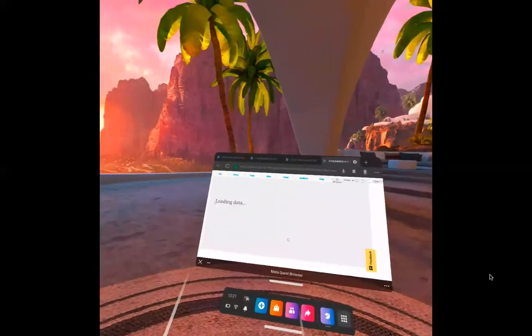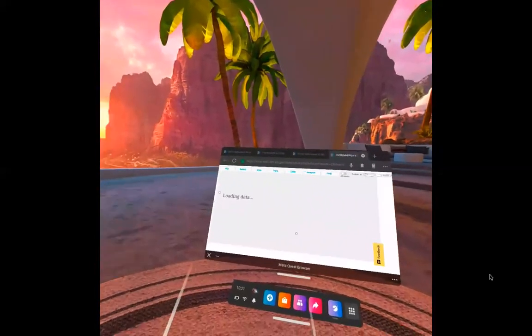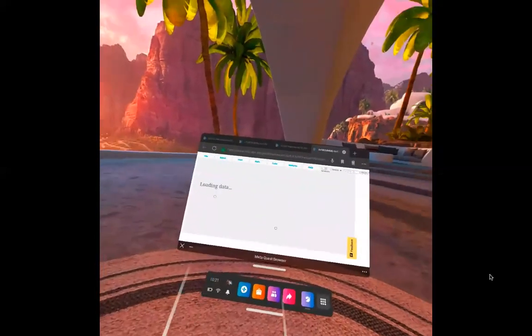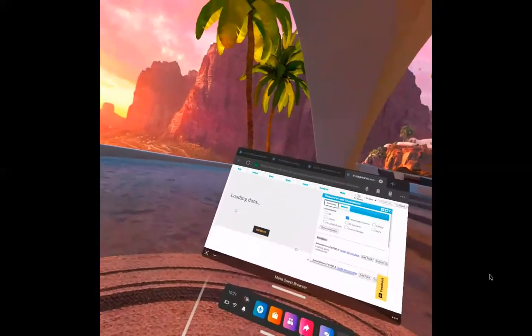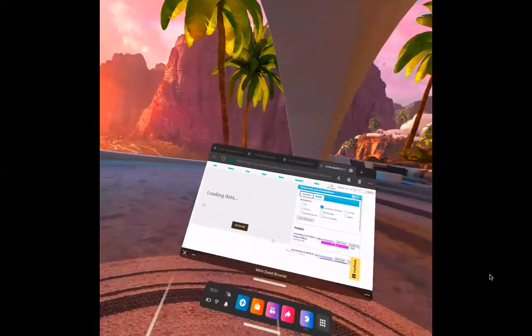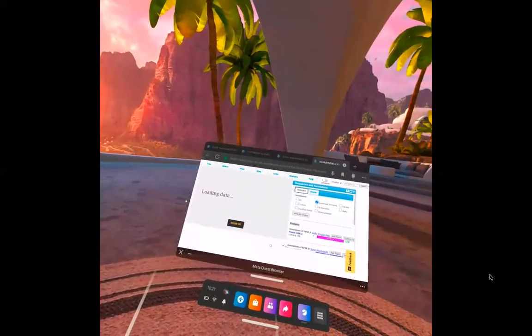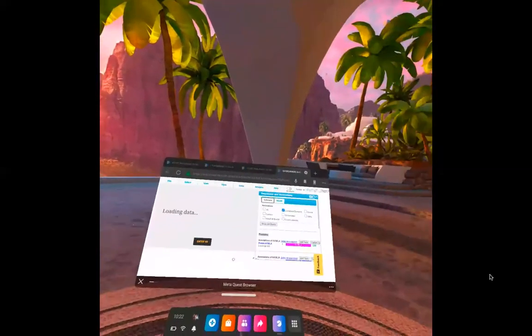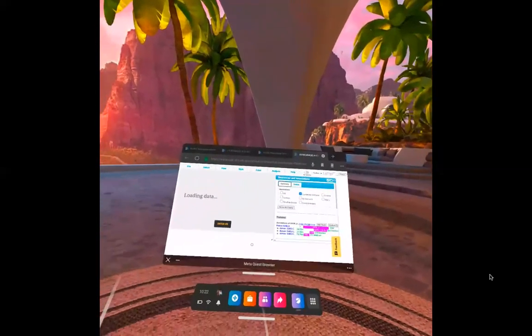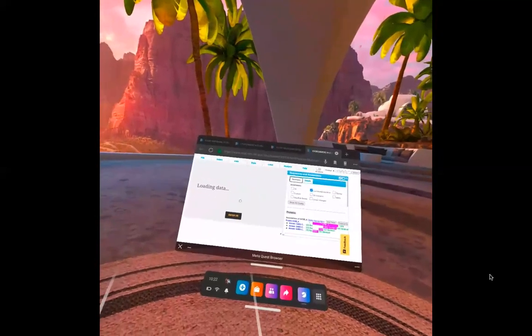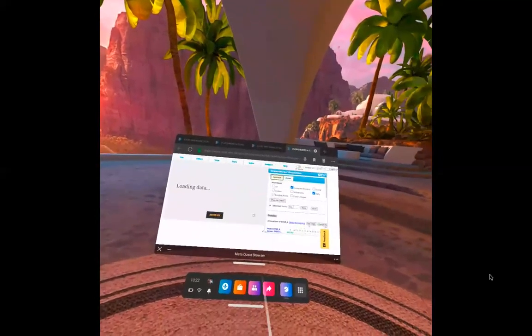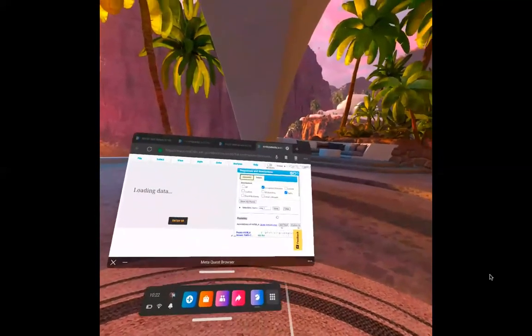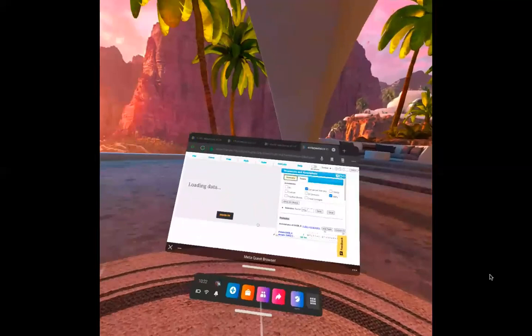Wait for a few seconds, so let it load up. It's doing all the mutation analysis.